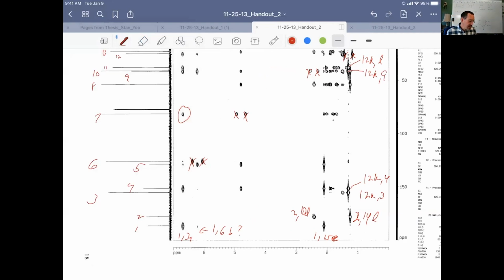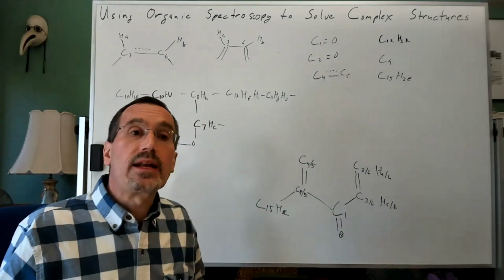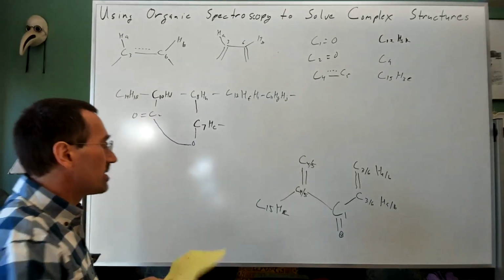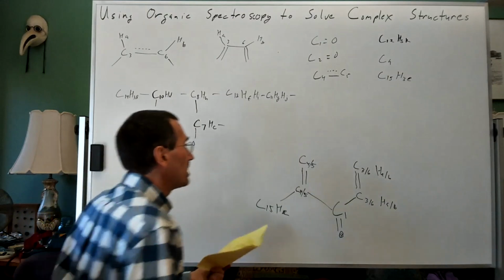All right, I wanted to point this out for anyone who did analyze the hell out of the spectrum. We do see a cross peak of 3A with 7. This is a J4CH that's coming up. This is a long-range coupling, basically some type of W coupling. For anyone who saw this, that may be surprising. All right, I want to finish up at this point, and if I can't finish up, I will finish up in discussion here. Okay, so that's the linchpin.